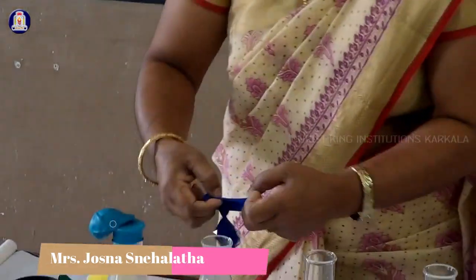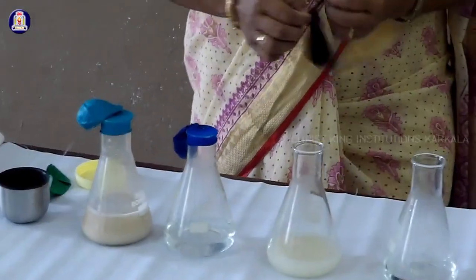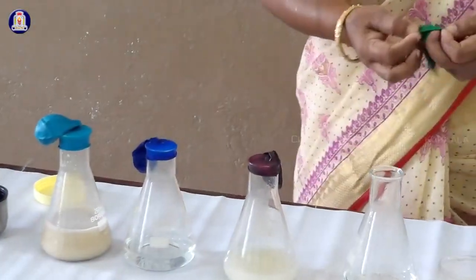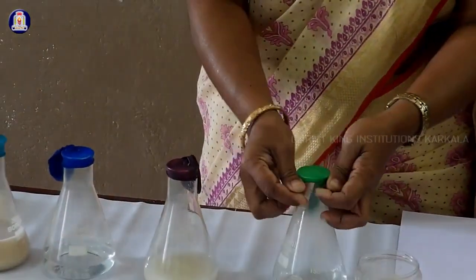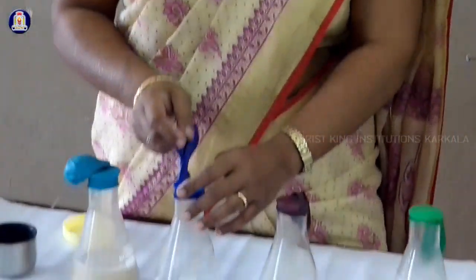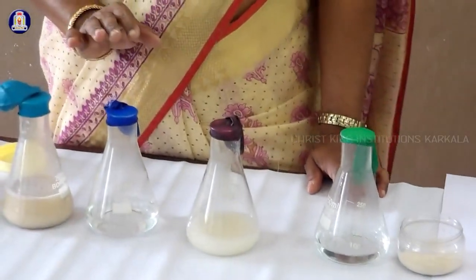We can take any color, but for identification, keep in mind the second is only the sugar solution, the third one yeast with water, and the fourth one only boiling water. Keep them for at least 6 or 8 hours. Then we can identify the respiration process in the yeast cell after a few hours.